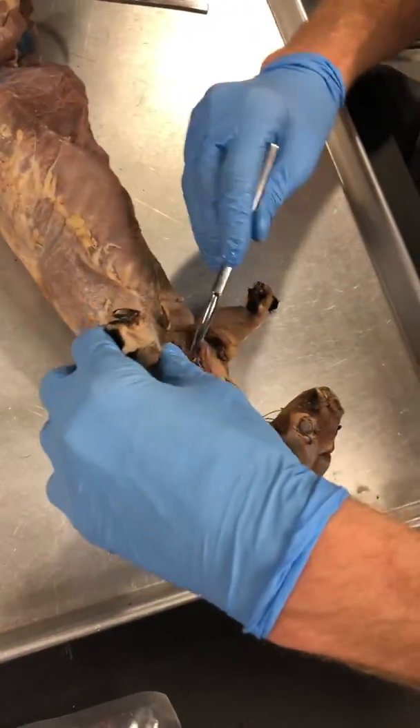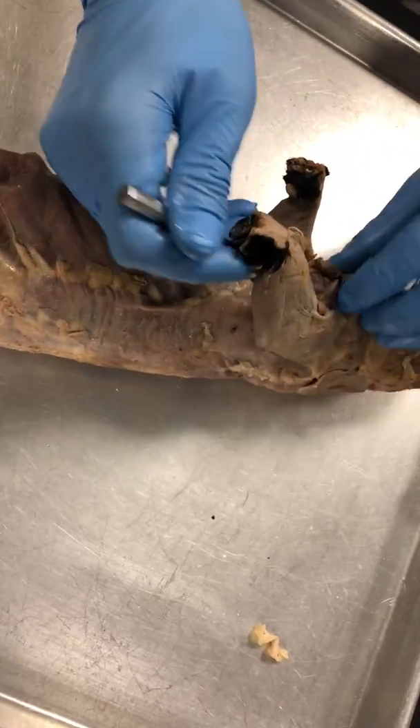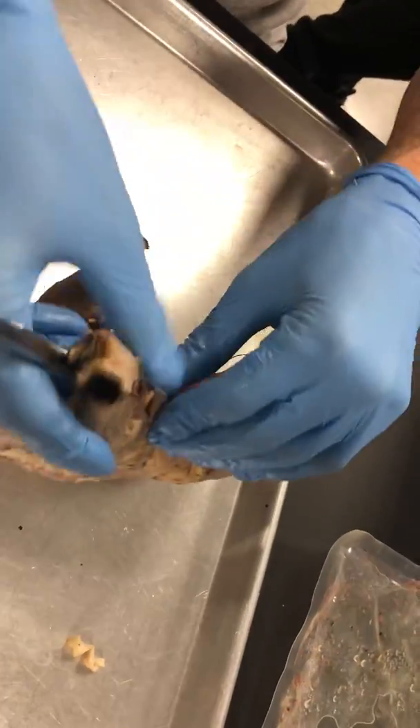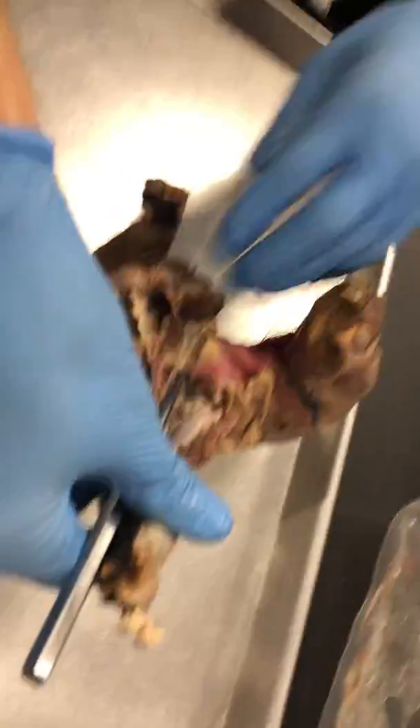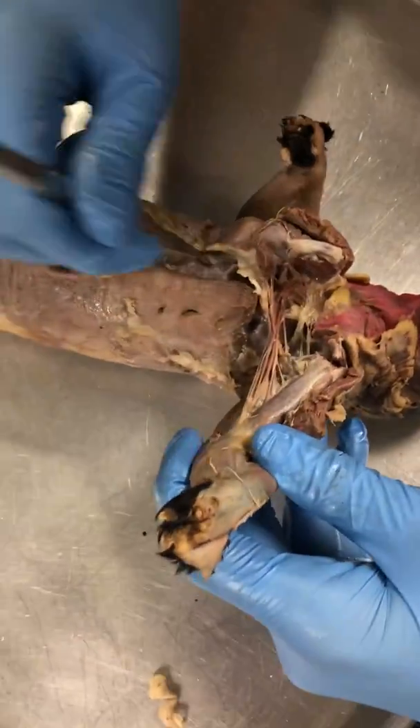Pec muscle. I'm gonna get the probe under the pec muscle. Make sure I'm not cutting any of the neurovasculature. So, under the pec, get a probe under there. You can kind of eyeball and make sure that this is all clear, and then cut away and reflect that pec. So you can see all of these nerves and vessels here.